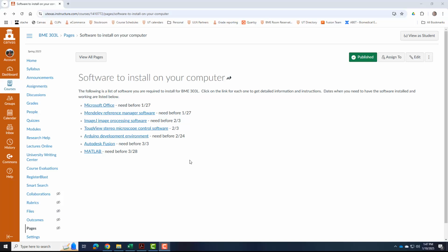Hi everybody, this is Dr. Dan, and for BME 303L you're going to have to install this ToupView stereo microscope control software.